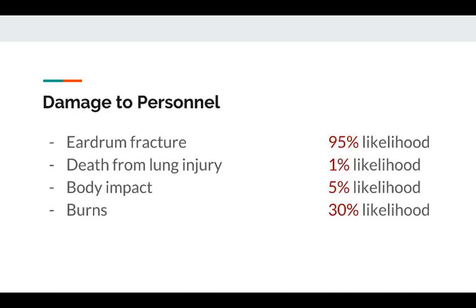When it comes to probability, eardrum fractures and burns tend to be the most likely. When it comes to severity, death from lung injury is a big one. Body impact is another, and then burns can also be very, very dangerous and can, in fact, be fatal to nearby personnel.